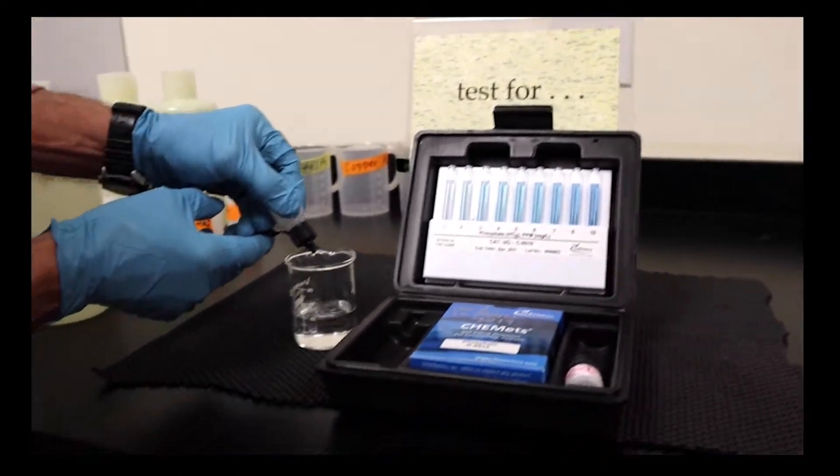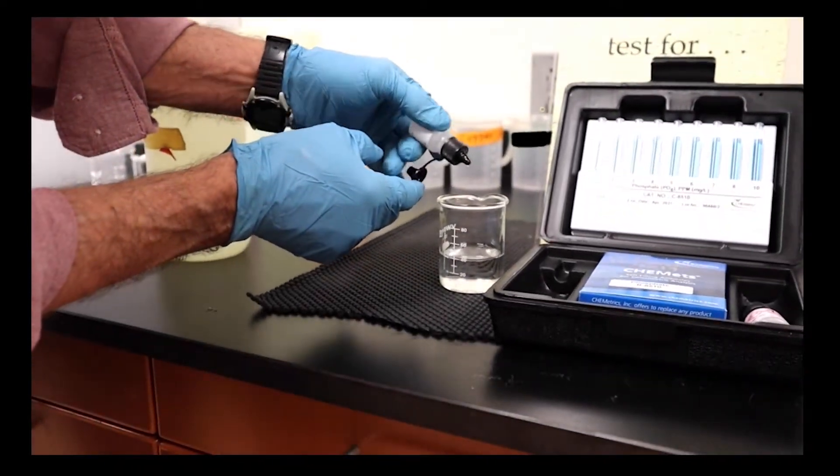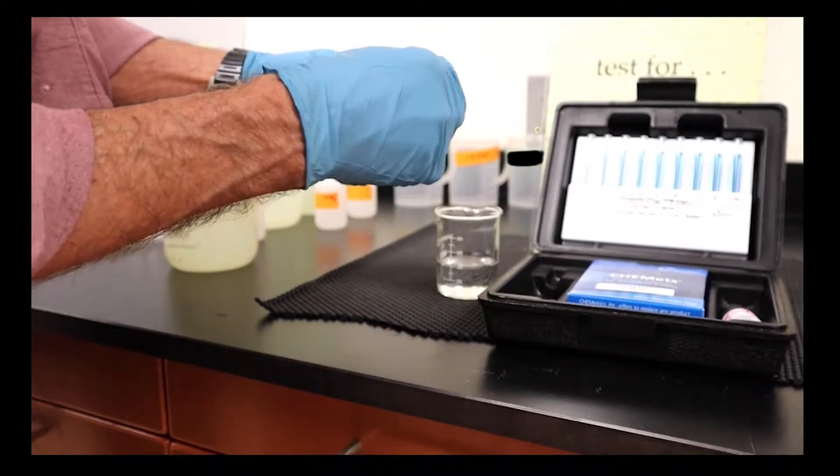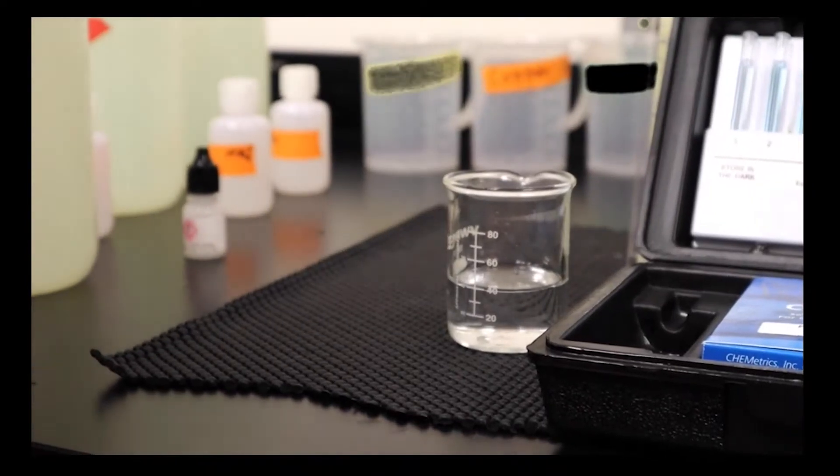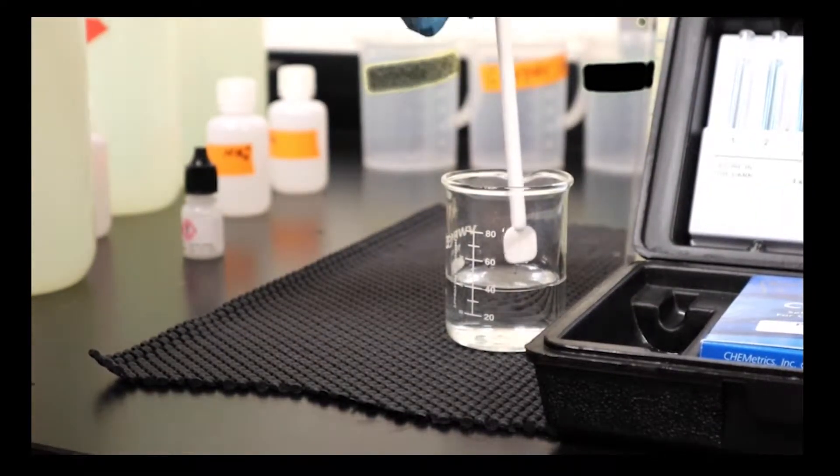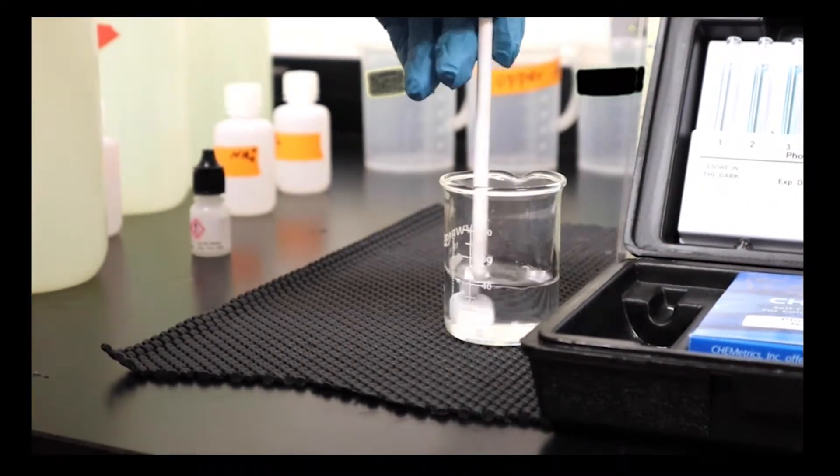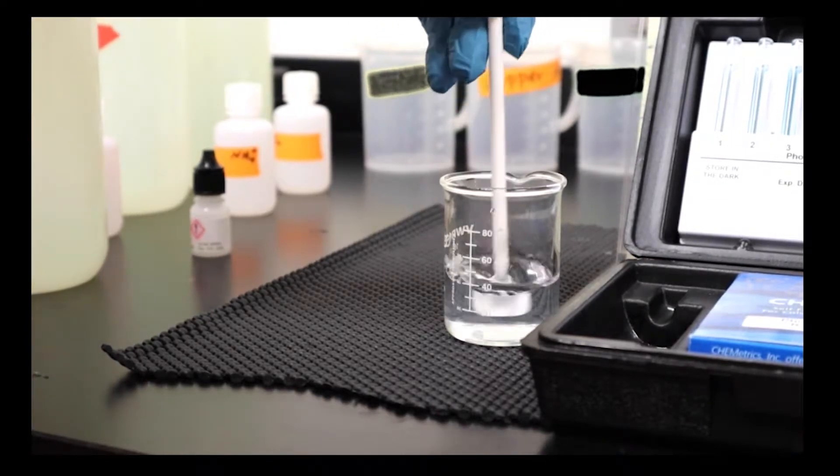One of the secrets of doing this is that there's so much extra reagent here that we are not going to be limited by the amount of reagent, so we'll mix this well.